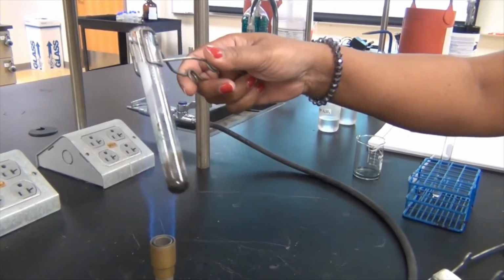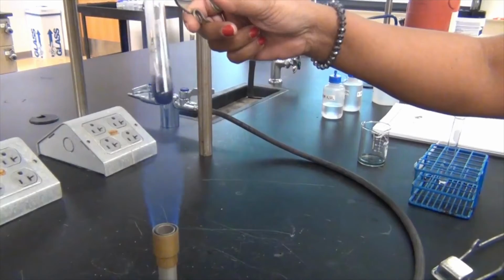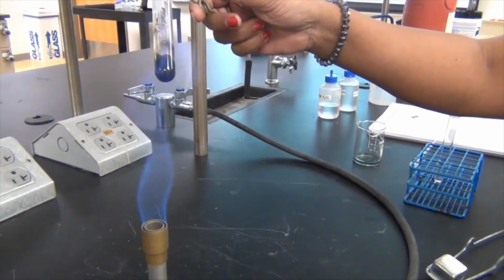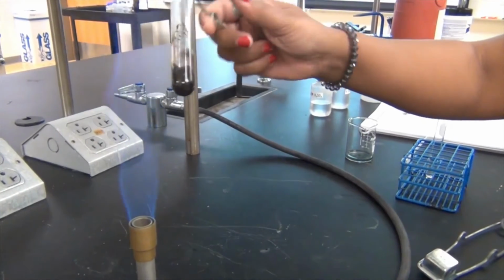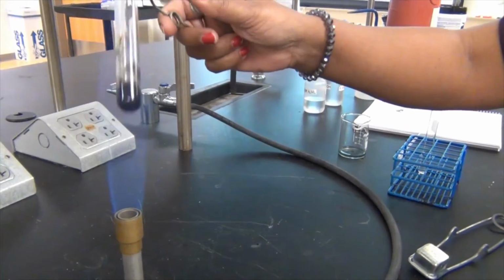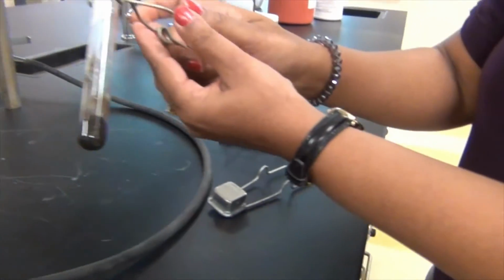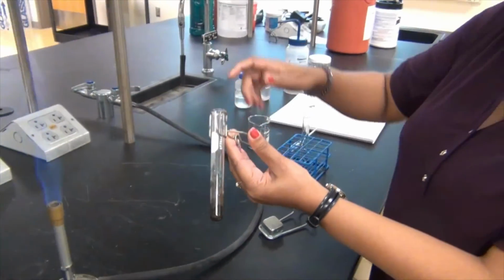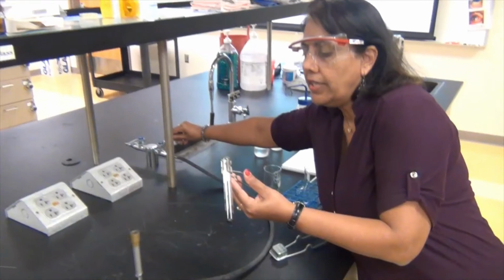And I hope you saw what happened. Right. And that's it. Okay. That was the very quick reaction that happened right in front of your eyes as we were heating it. And I'm done with that. So I'm going to turn off the Bunsen burner now.